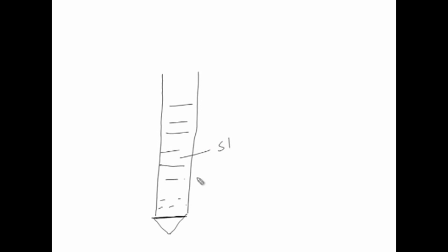So, let me show you what a column actually looks like. If you see, the column is a simple tube-like structure, which is closed on one side. It will be closed on both sides while running, but to support the matrix there is a disc with a filter, and the material which is your matrix will be filled in here. So, the stationary phase or matrix is put in here.